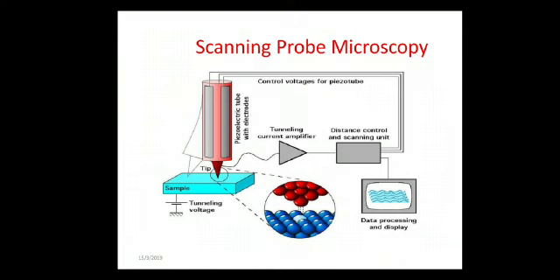They use a physical probe to scan back and forth over the surface of a sample. During this scanning process, a computer gathers data that are used to generate an image of the surface. In addition to visualizing nanoscale structures, some kinds of scanning probe microscopes can be used to manipulate individual atoms and move them to make specific patterns.